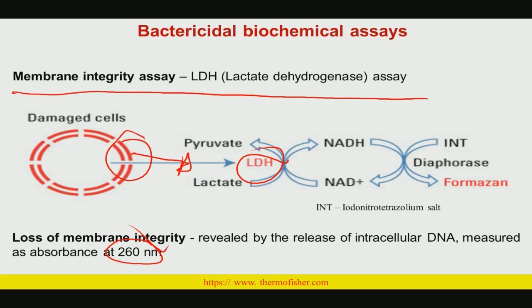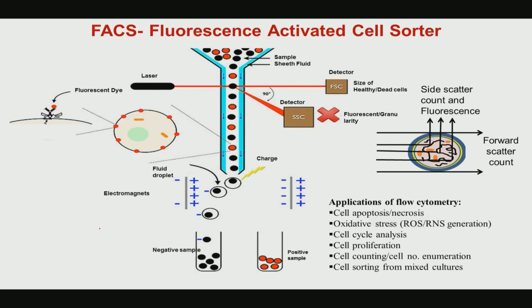All these biochemical reagents or enzymes are detected at different wavelengths, as has been mentioned earlier also. Okay.